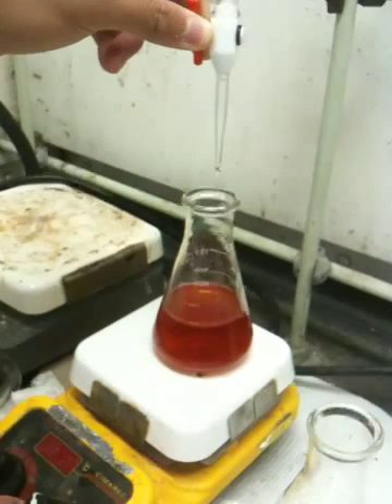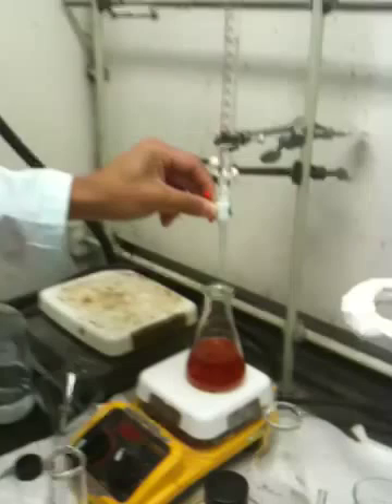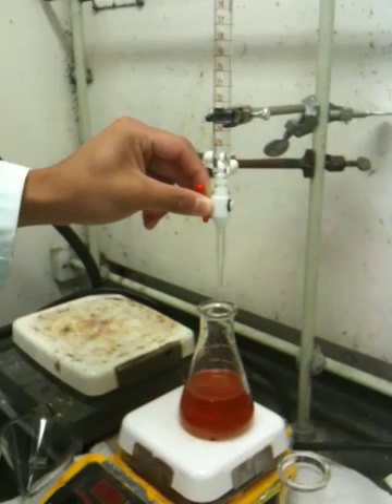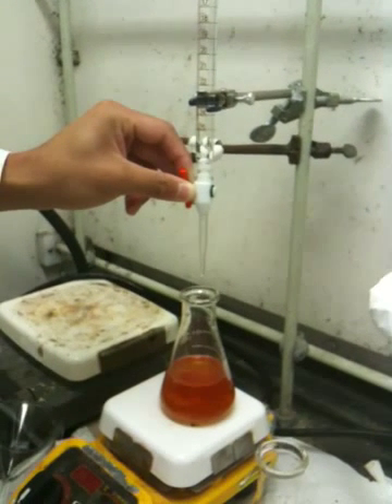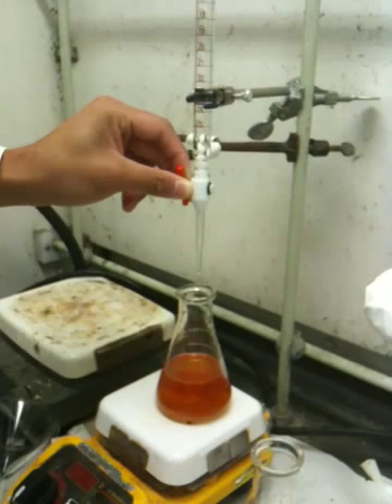All right, so here we are in our chem lab. We have Dice K over here — say hi Dice K. He's titrating some NA2S2O3 into an Erlenmeyer flask which has 0.1 grams of vitamin C crushed, 15 mils of water.